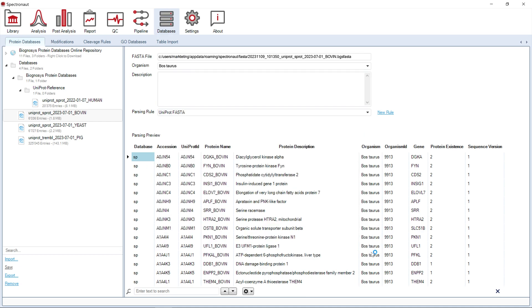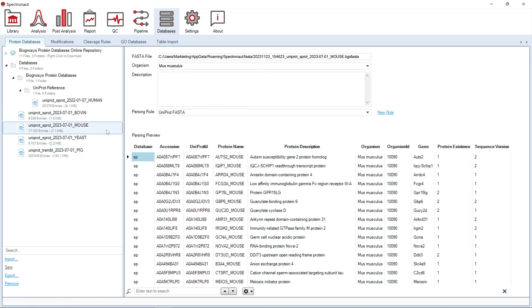Once your new Protein database is imported, it will be available in the database tree during library generation or analysis setup.